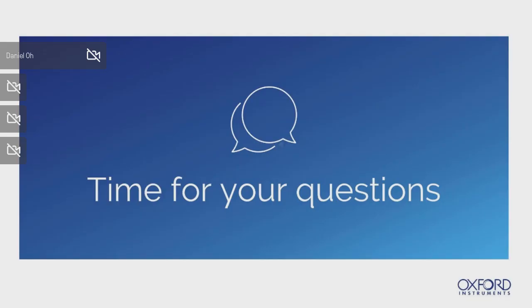Thank you. Okay, and I can also see two questions from the same customer. The first one is, does 3D rendering require third-party software? No, I don't think so.